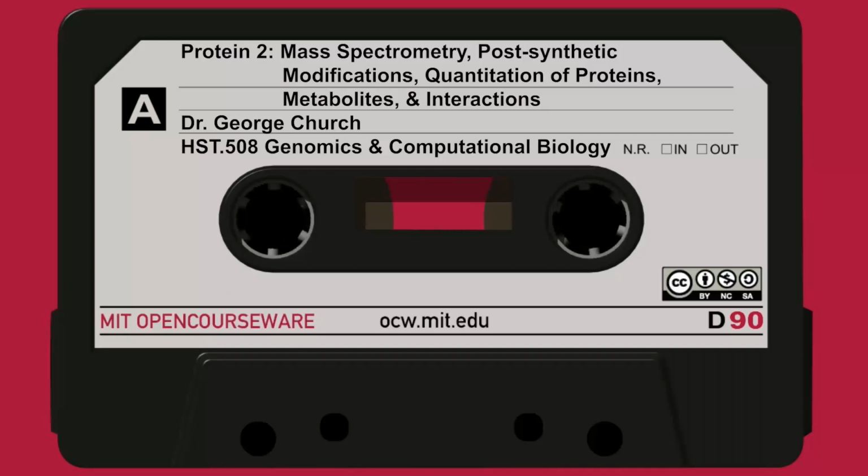Now how this works, this is a blow-up of something that was in an earlier slide where you can really see the region where you've got electrospray. We'll have an even closer blow-up of this in a moment.